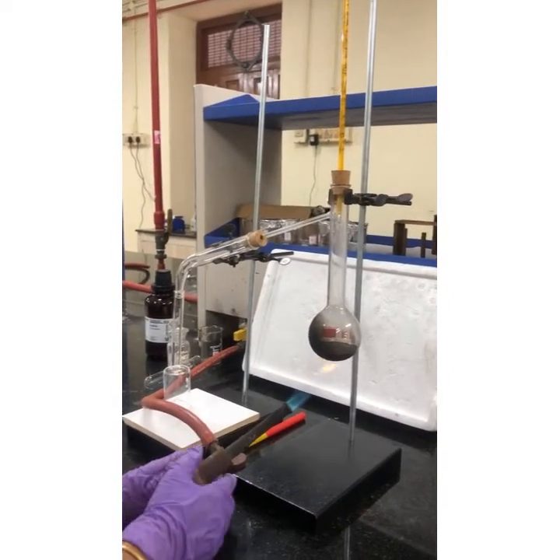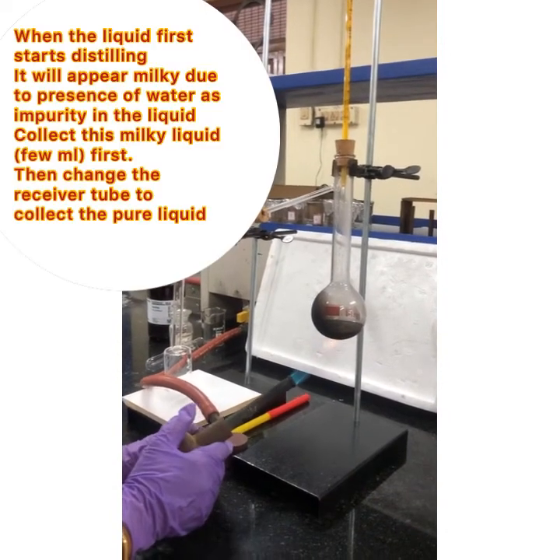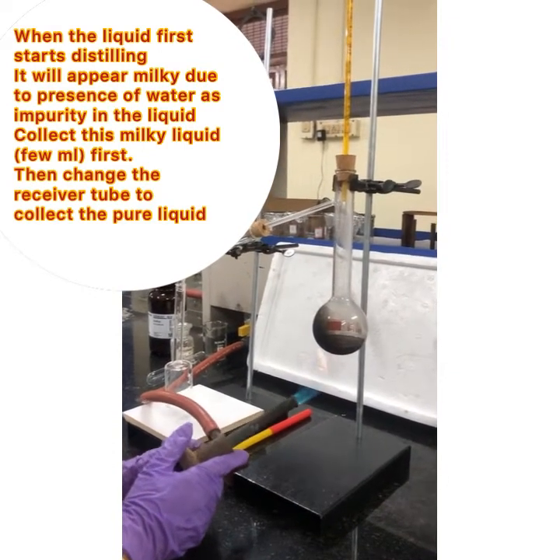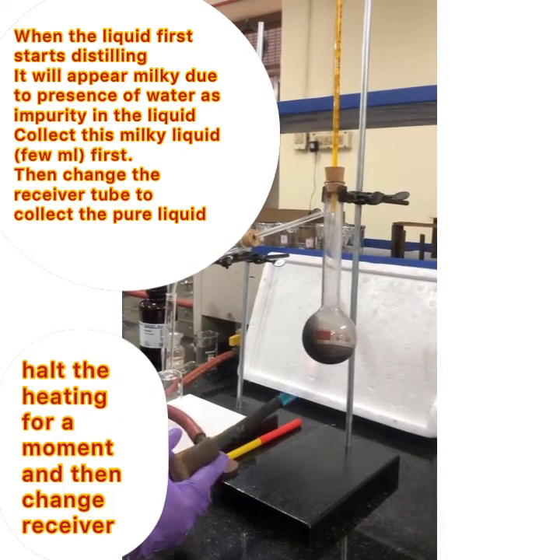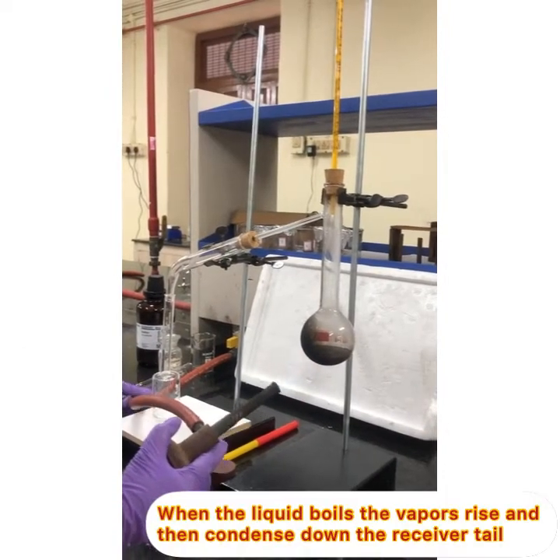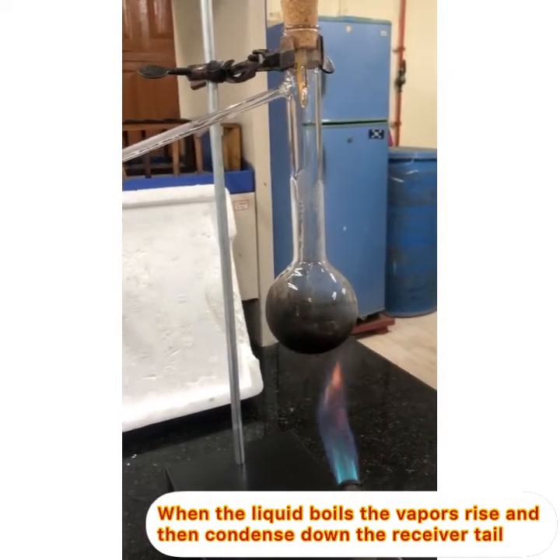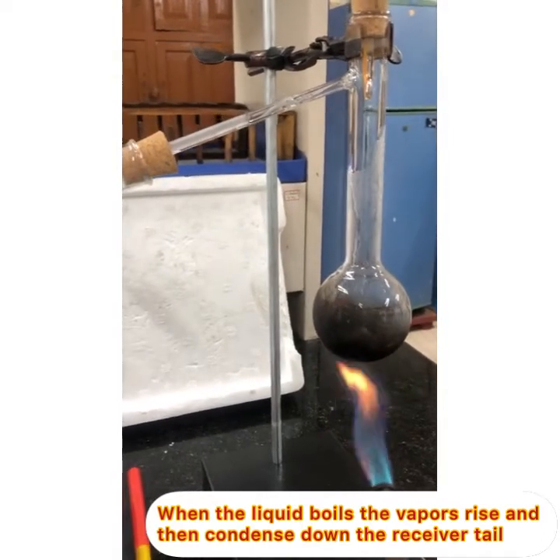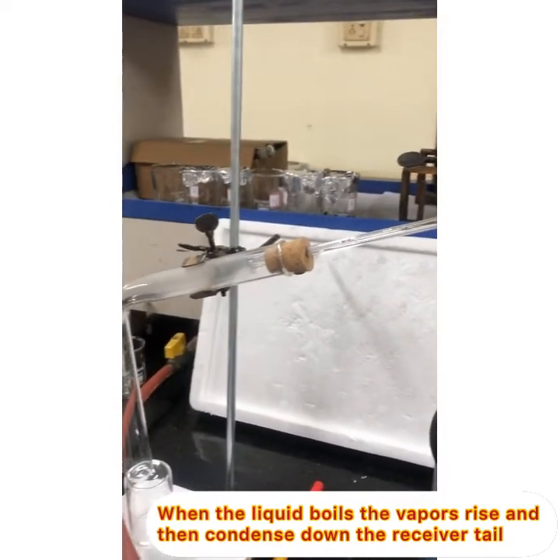Continue the distillation so that the liquid distills over and pure liquid is collected in the receiver. The first few drops of liquid when it distills over will contain water and have to be removed, so you have to change the receiver and collect the pure liquid in the second receiver. You can see the pure liquid dripping down the side tube and getting collected in the boiling tube.